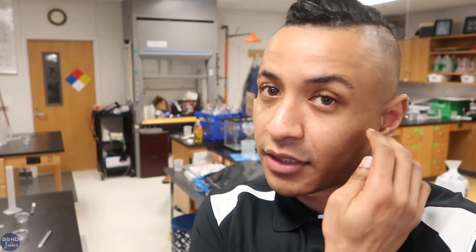I'm trying to see if the lab is completely set up — I don't think it is yet. Similar to the limiting reactant lab they did last week with the baking soda and the vinegar, they're going to be in pairs again. Sorry, my room's a little bit of a mess; I need to clean up before the lab.